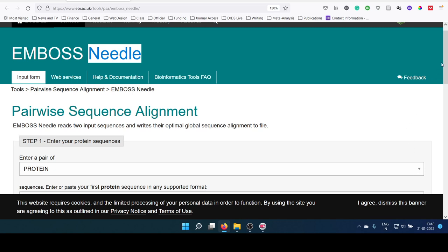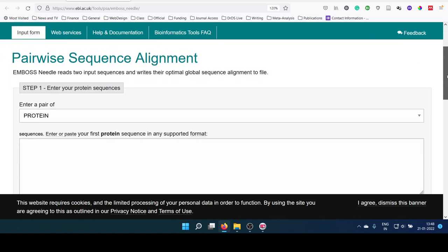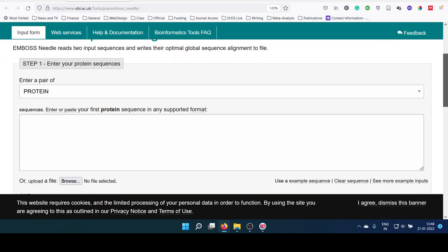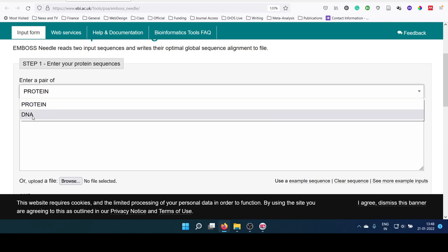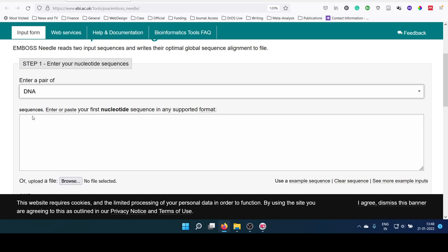When we see this page, there is an option to select whether you are trying to align protein or DNA. If your sequence is DNA, you have to select DNA. If you are selecting protein and giving a nucleotide input, then it will not be supported. Proper selection of the nature of the sequence should be done initially. If you are giving an input sequence as DNA, then select it as DNA.